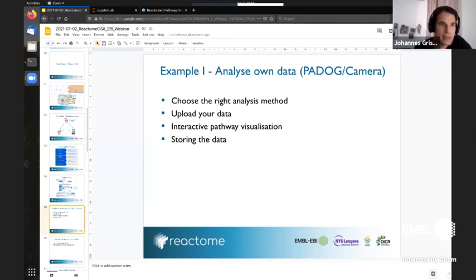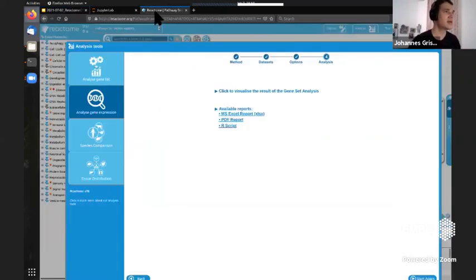So I'm just keeping this quick. The background is not used in these approaches. Like I showed you, we're only looking at the different distributions. So I'm just going back now to my analysis that is running. The analysis is done in the meantime. This has been done probably for a few minutes already.